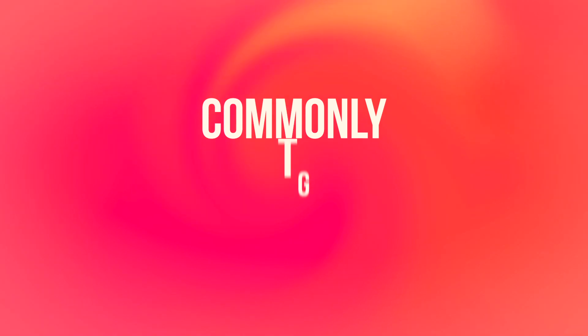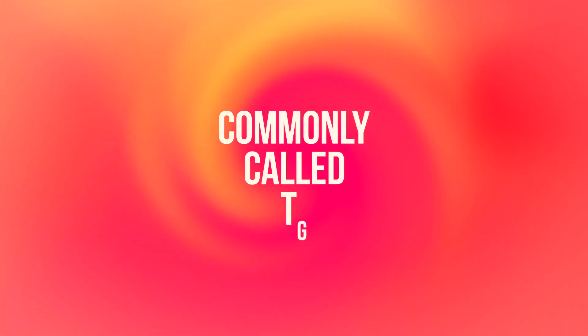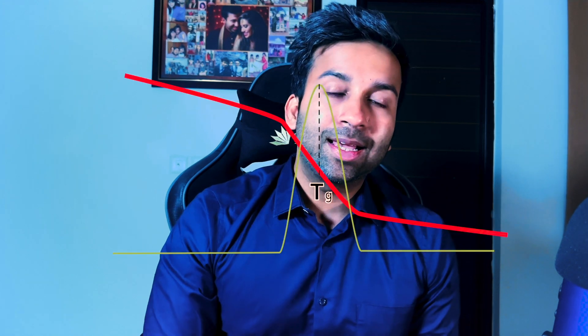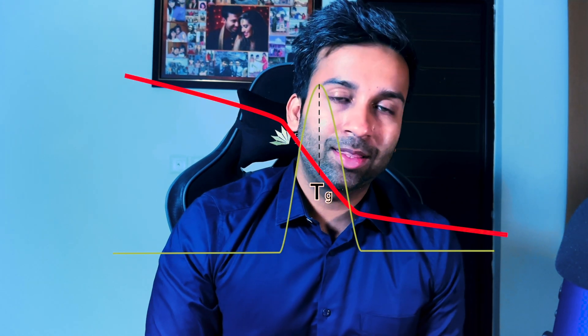Glass transition temperature is the temperature at which an amorphous polymer changes from brittle hard material to a soft leathery material due to the changes in chain mobility. The glass transition temperature, which is also called the Tg, does not happen at any one temperature but over a range of temperatures. This is seen as a step in the DSC curve.